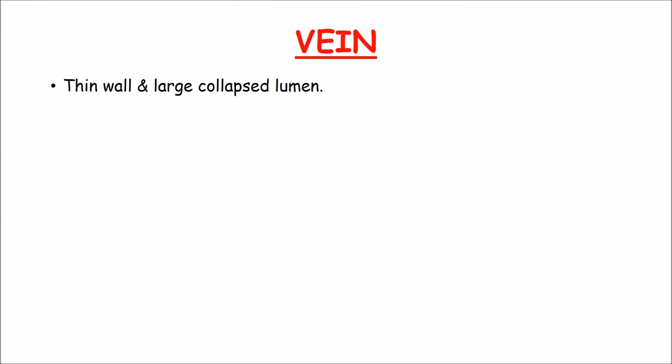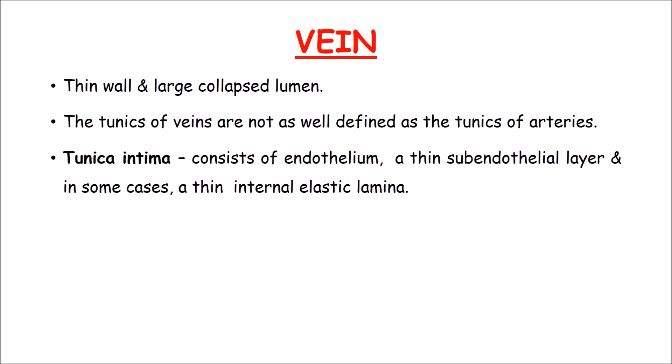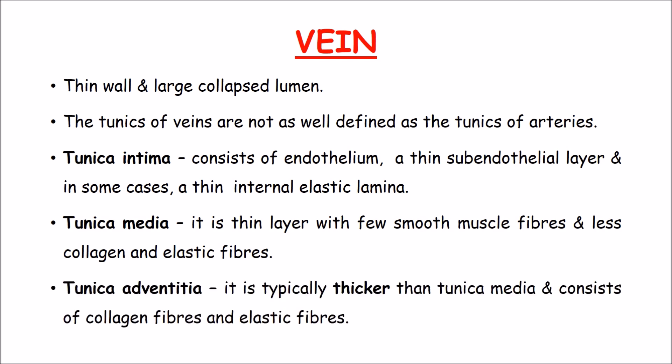The vein is thin-walled with a large collapsed lumen. The tunics of veins are not as well defined as those of arteries. The tunica intima consists of endothelium, a subendothelial layer, and in some cases a thin internal elastic lamina. The tunica media is a thin layer with few smooth muscle fibres and less collagen and elastic fibres. The tunica adventitia is typically thicker than the tunica media and consists of collagen and elastic fibres.